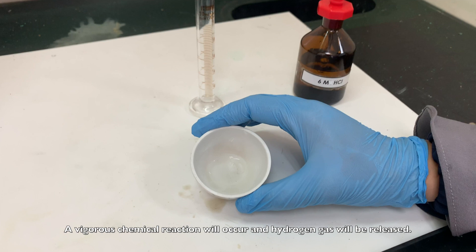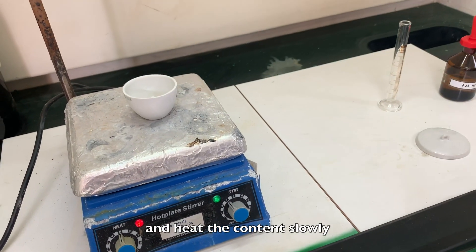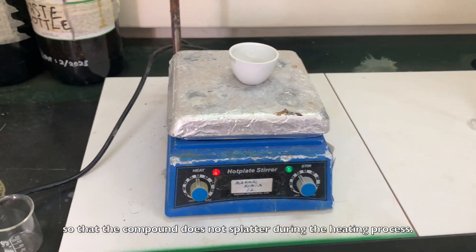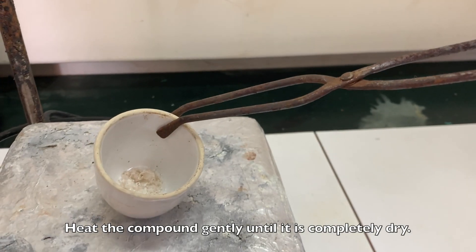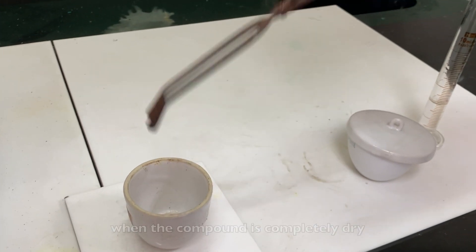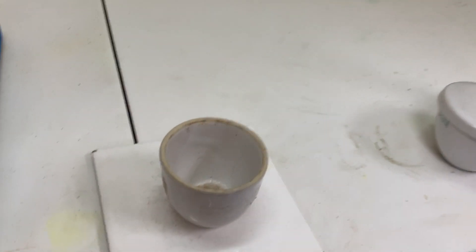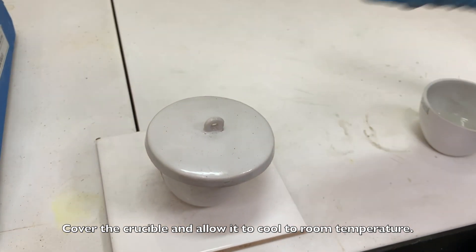A vigorous chemical reaction will occur and hydrogen gas will be released. Place the crucible on a hot plate in the fume cupboard and heat the contents slowly so that the compound does not splatter during the heating process. Heat the compound gently until it is completely dry. Remove the crucible from the hot plate immediately when the compound is completely dry to avoid the compound from melting. Cover the crucible and allow it to cool to room temperature.